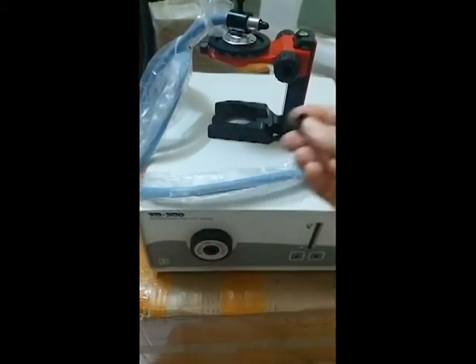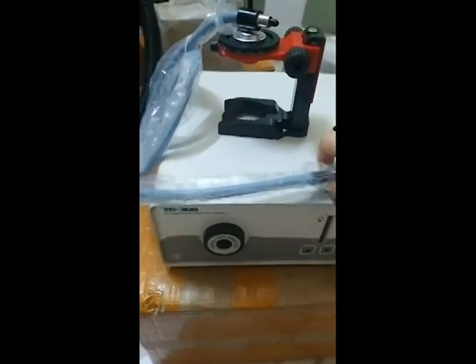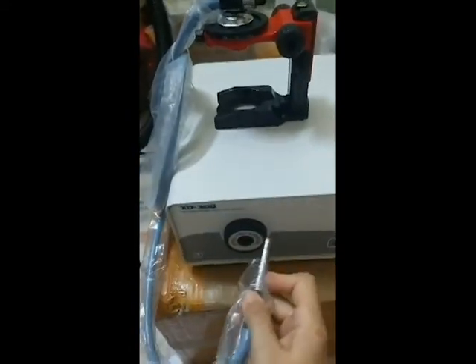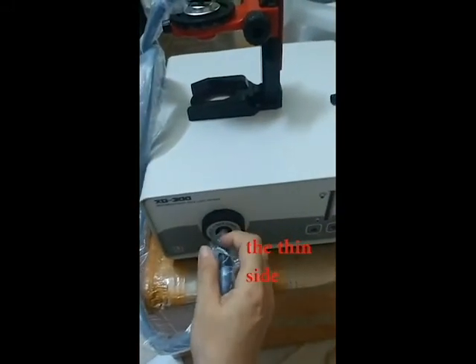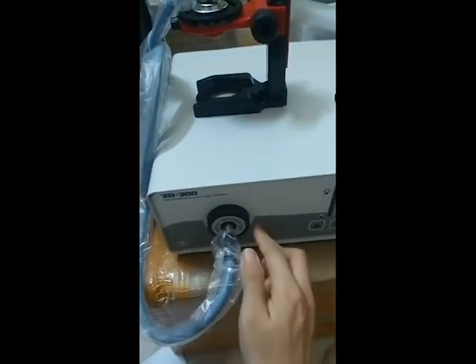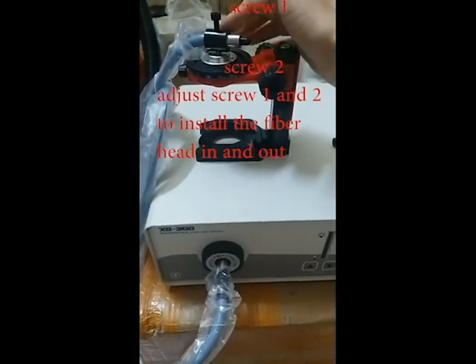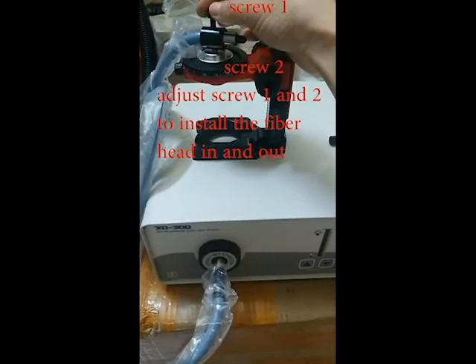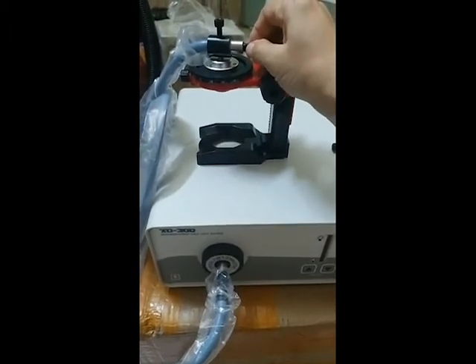You remove the cap from the fiber, install the fiber into the fiber port, and install the other side to the holder by the screw. You can tie it, and also remove the keys.